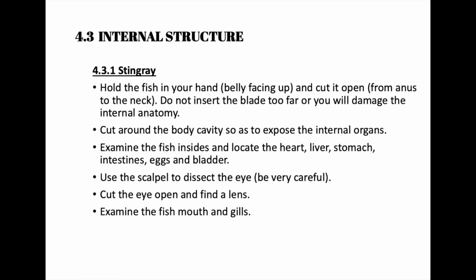4.3 Internal morphology of stingray. Hold the fish in your hand, belly facing up, and cut it open from anus to the neck. Do not insert the blade too far, or you will damage the internal anatomy. Cut around the body cavity so as to expose the internal organs. Examine the fish inside and locate the heart, liver, stomach, intestine, egg, and bladder.